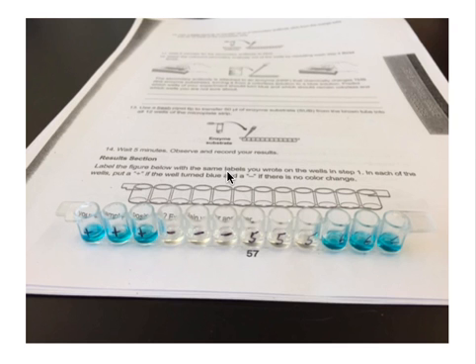So here are the results of an experiment where we can see that these first 6 were the control group. So we knew that these 3 were positive, and we knew that these 3 were negative. So you would expect a color change for the positive ones and not for here.